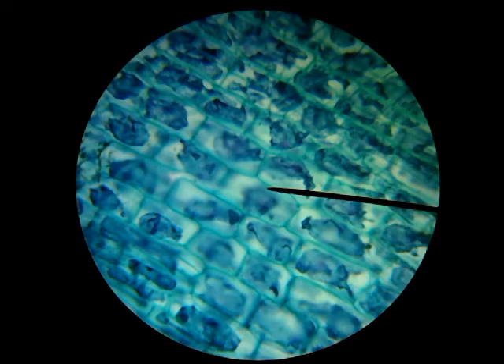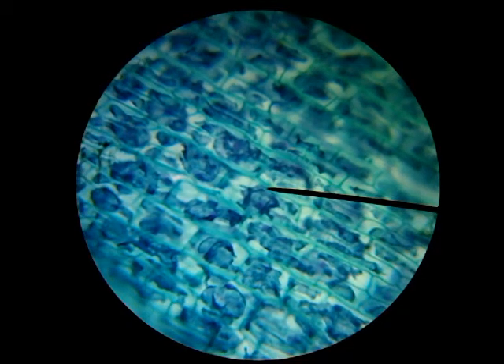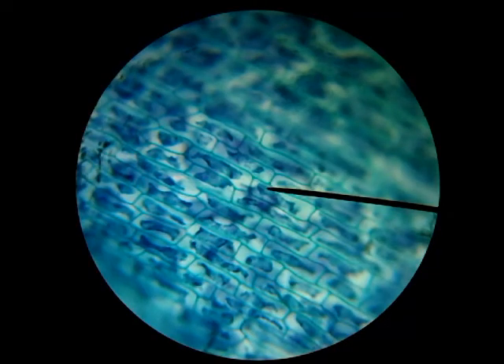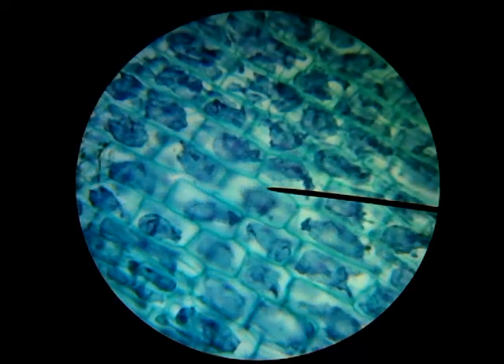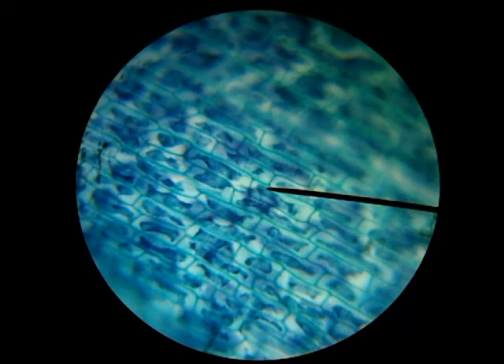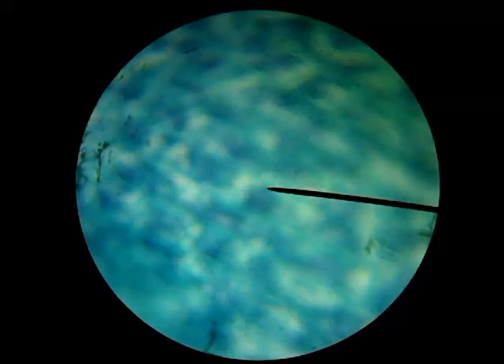I'm going to change the focus a little bit and you'll see different things as I do that. By changing the focus, we can actually see different layers of cells. Here's one layer, and if I go back to where I was, you can see another layer — so we can see different layers of cells by adjusting the focus in and out.